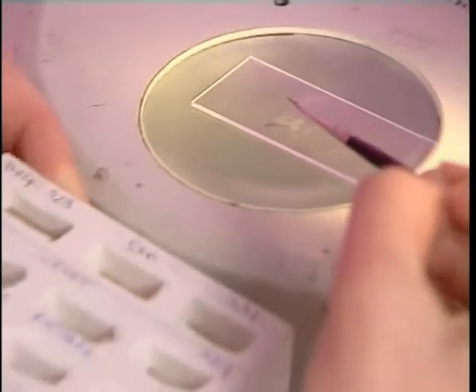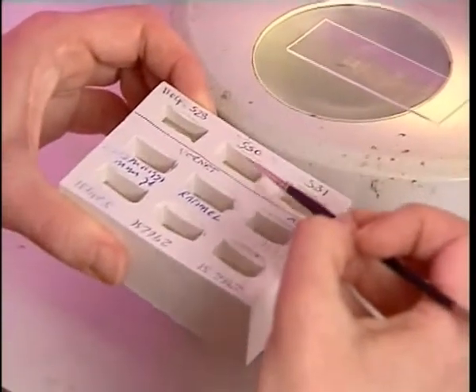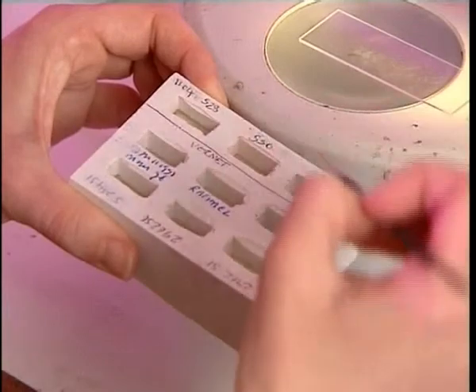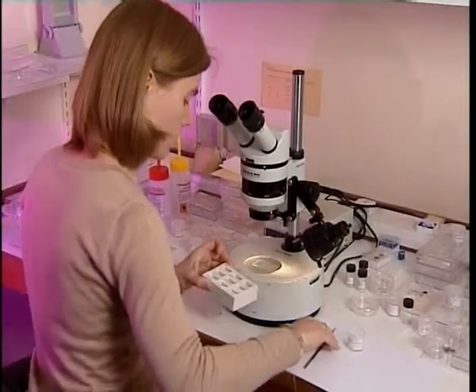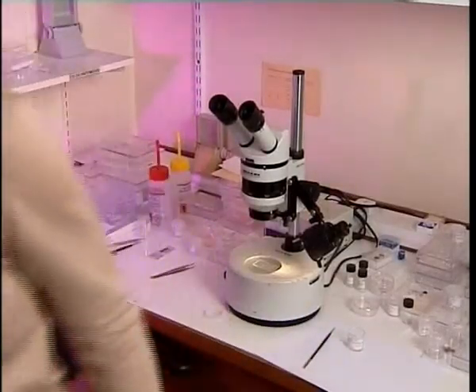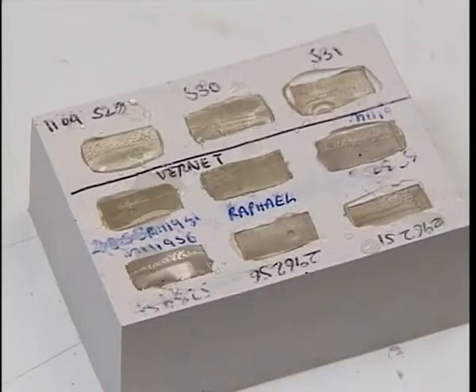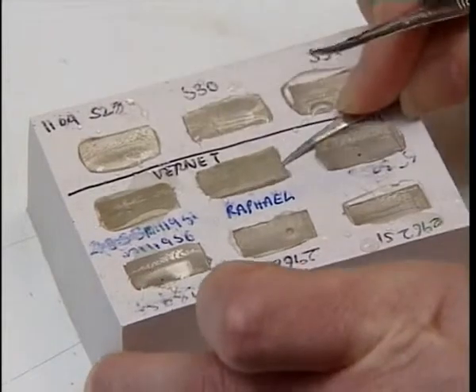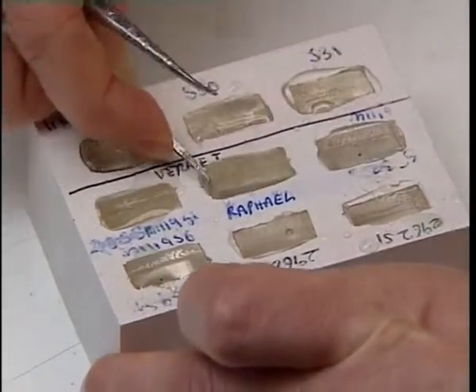And then place it into a mould to mount it in polyester resin. The sample from Raphael's painting is now mounted in the resin. I'm going to take it out of the mould.